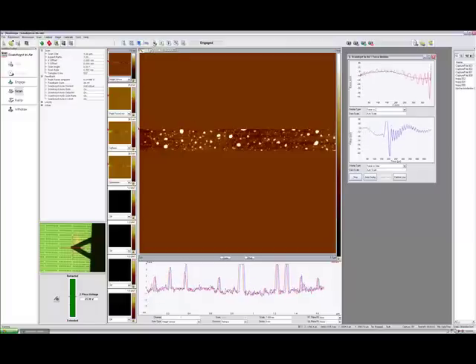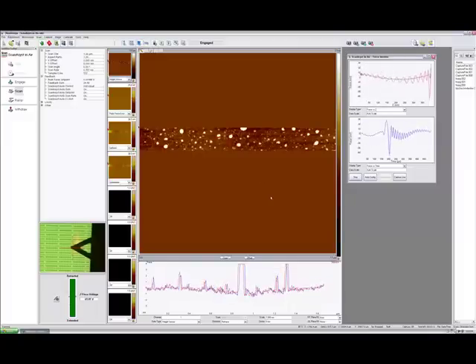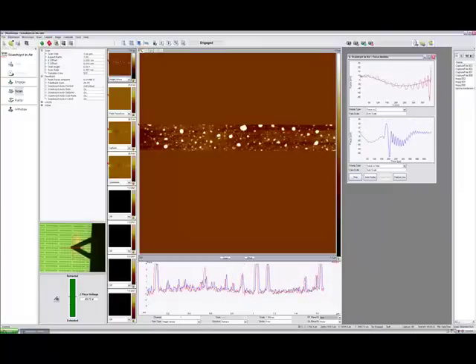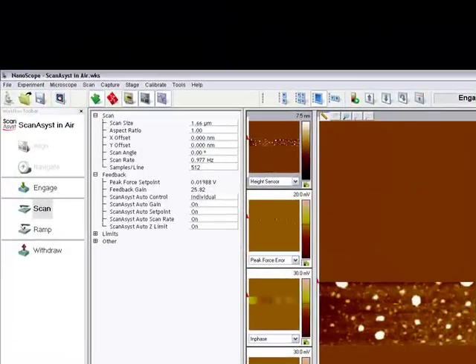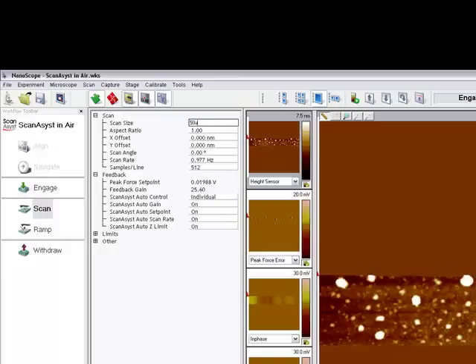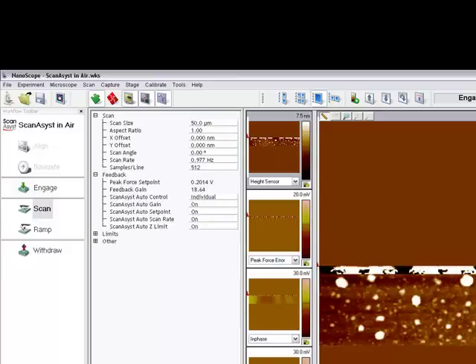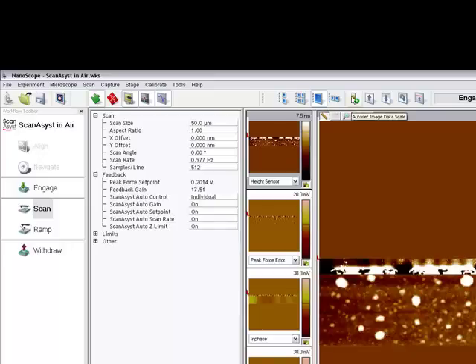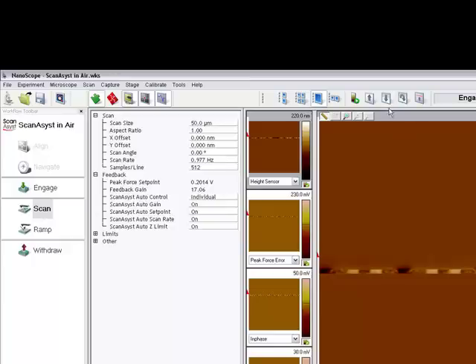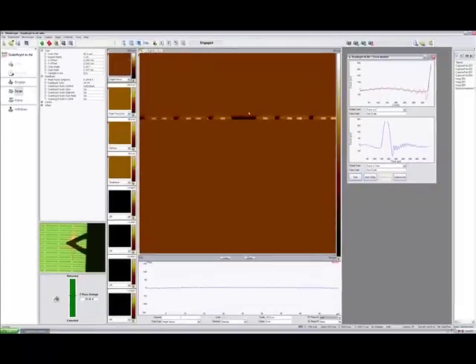In the top window we see the traditional force versus Z curve; at the bottom we see the force curve in the time domain. The system is already scanning — it automatically selected a small scan area and you can see the images without any streaks. Tracking is just perfect. To force the system to optimize again, just click on the Auto-Config button in the force monitor window. Now we are going to select a larger scan size — 50 micrometers — and that will be the only thing we change in terms of scan parameters. Everything else will be adjusted completely automatically. If you click the Auto-Scale Update button, the color scale will be updated instantaneously; otherwise you have to wait a couple of scan lines.